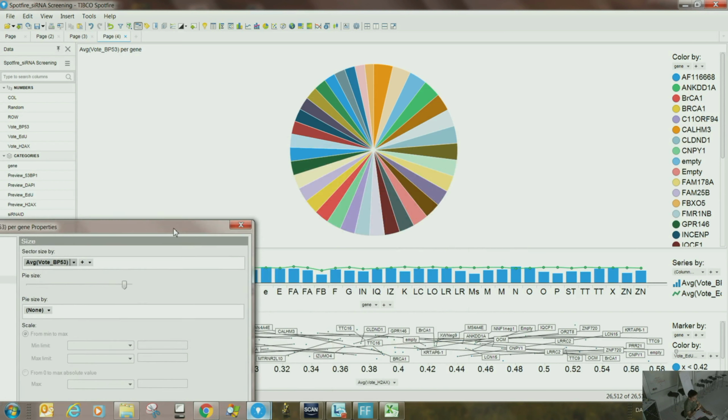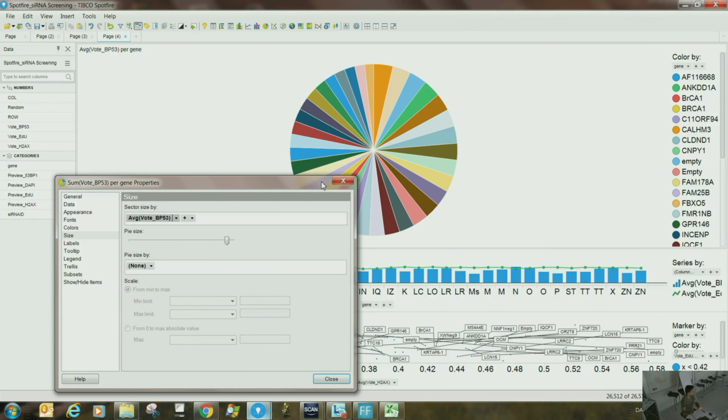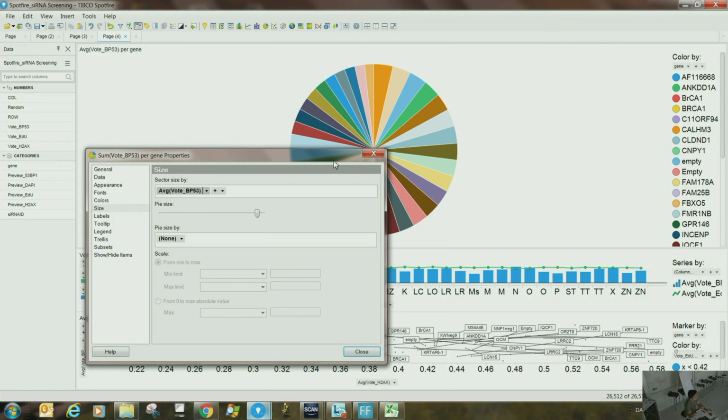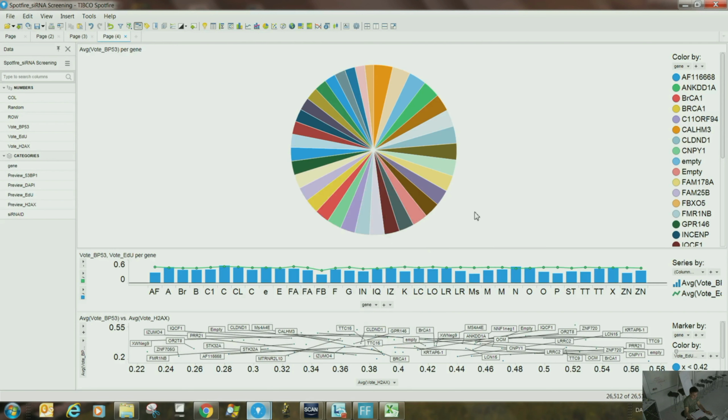Just to see how they organize. I think they're equally likely in that way, right? This is not a good example for a pie chart, okay? But you imagine, I think the best example would be that region example that I gave you, right? The Pacific region, Europe, and Asia, and stuff like that. Because this is the highest in hierarchy, so it should be basically kind of a well, for example, right? Within the plate. Sector size. That's fine.